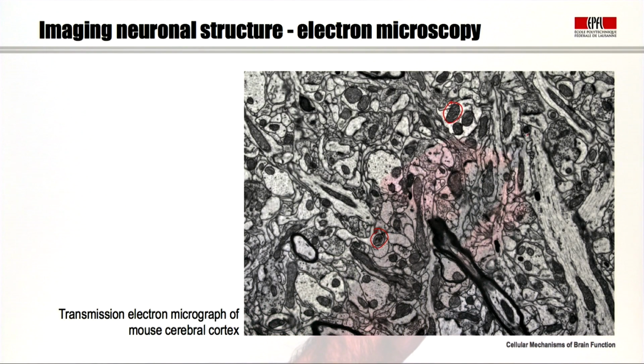On the right-hand side, we can see a very large dendrite that has been cut almost longitudinally, and in it you can see two mitochondria. You can also make out the thin shapes of the microtubules that run throughout structures like this.